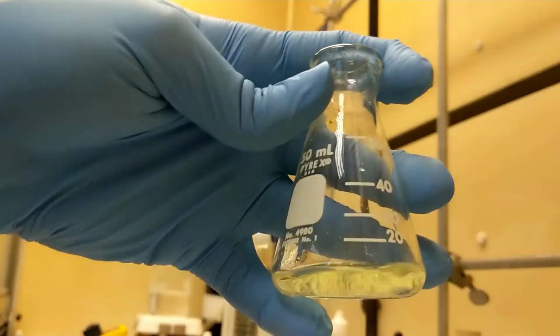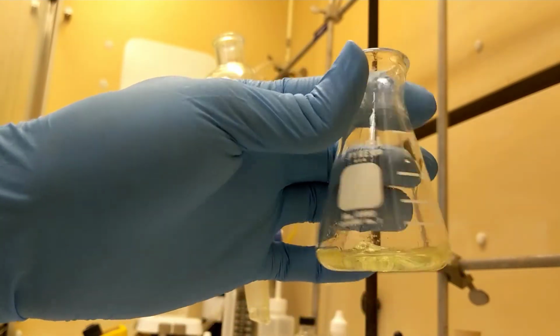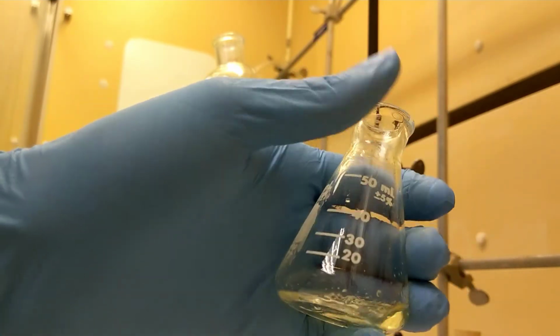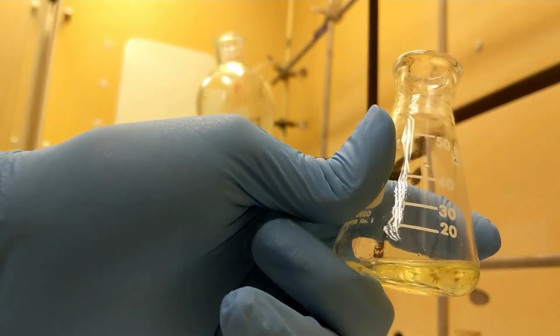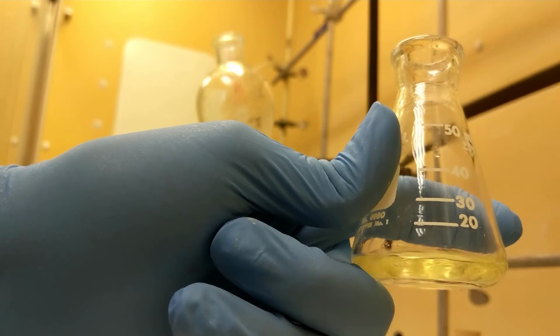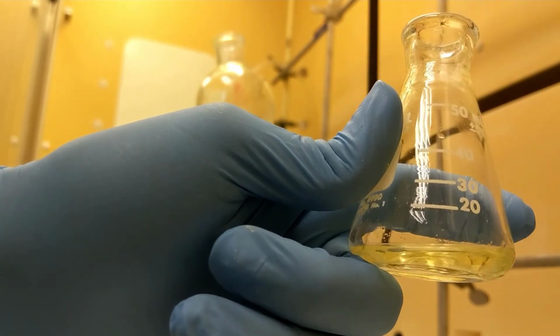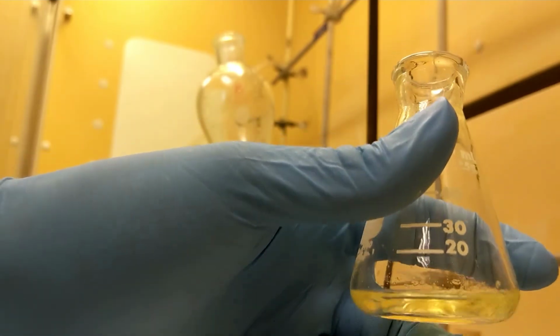Alright, this is what we've been working for. Clean, dry ether with pure unknown A extracted inside. All that's left is to evaporate off the ether and get our unknown A. I'll see you guys in a second.